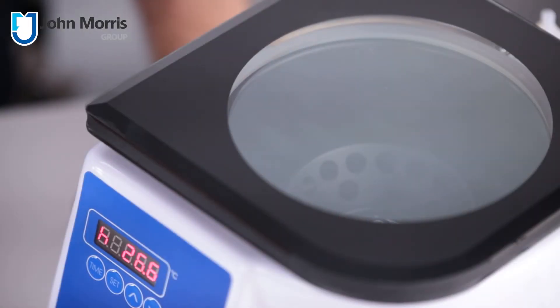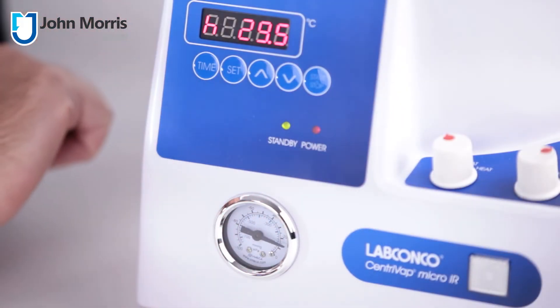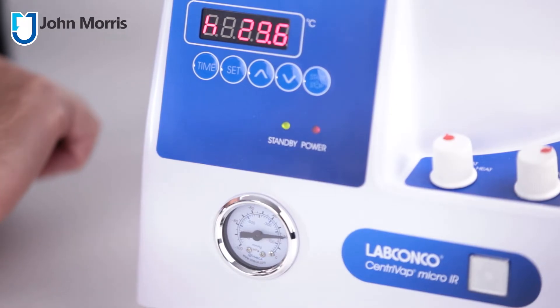This is achieved by two key properties of this product: namely centrifugation, which spins the sample, stopping any bubbles or splashes from exiting the tube and contaminating a nearby specimen; and vacuum. Vacuum reduces the boiling point, allowing you to remove solvents at a far reduced temperature.